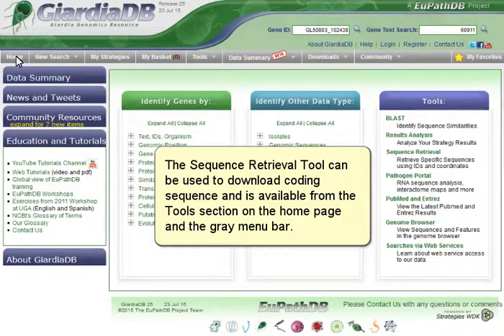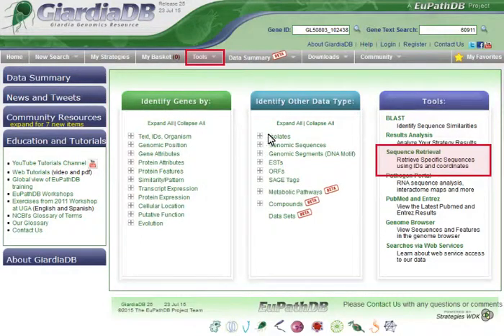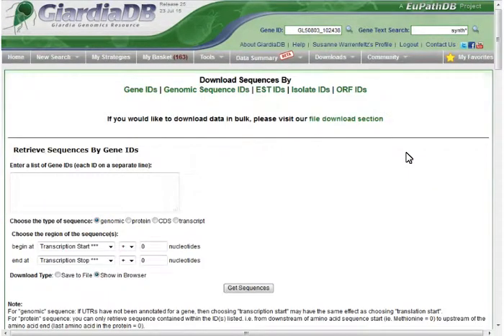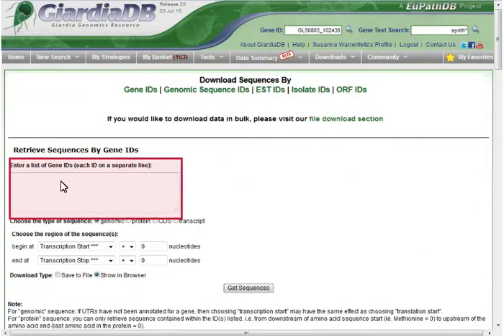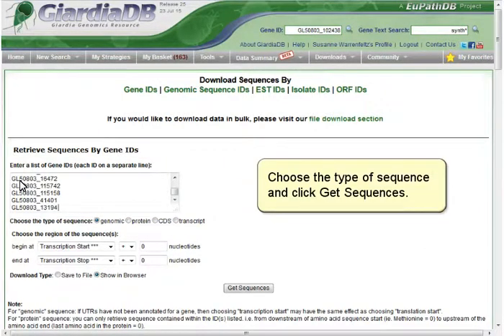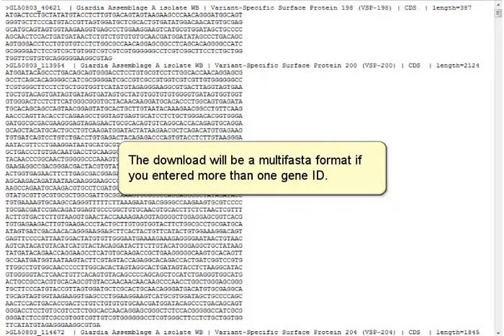The Sequence Retrieval tool can be used to download coding sequence and is available from the Tools section on the homepage and the gray menu bar. Paste your gene IDs into the text box. Choose the type of sequence and click Get Sequences. The download will be in multi-FASTA format if you entered more than one gene ID.